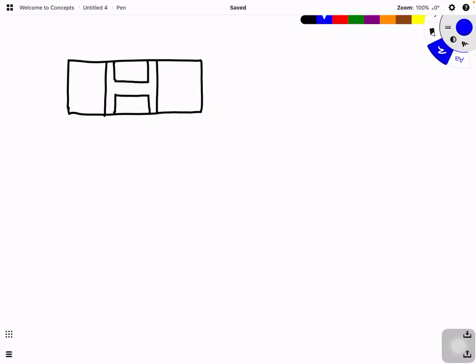This part is the groove. And at these two platforms here, you will have the counting grid. You will only see the grids under the light microscope or under the light.